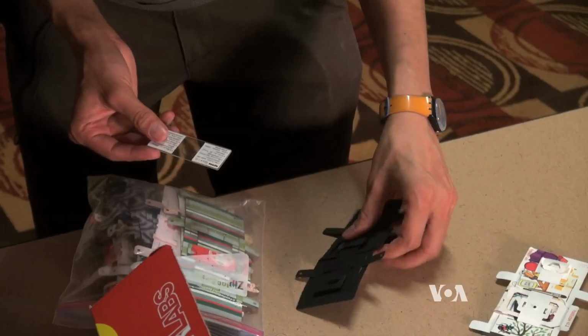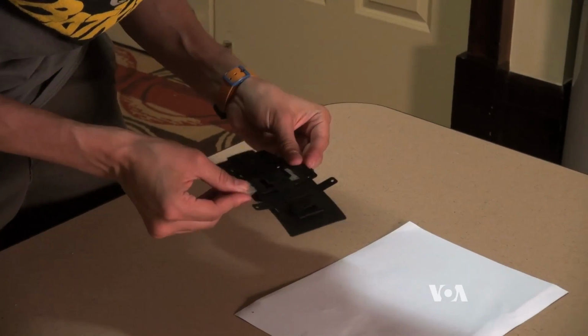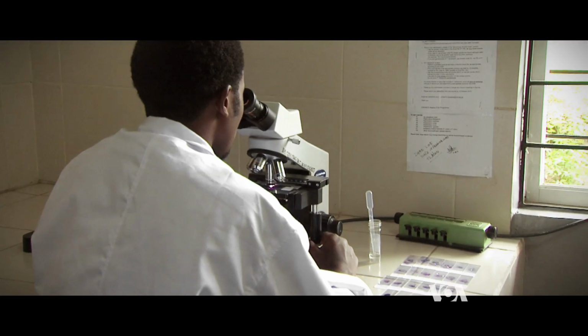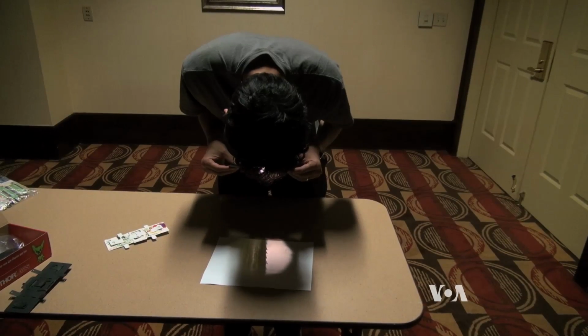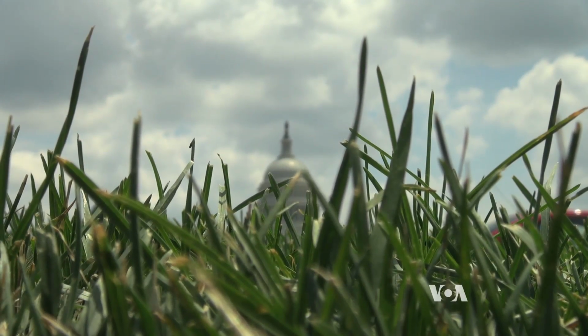As an engineer myself, I recognize that. But the microscope itself is not sufficient to change things. Health workers need training to know what they're looking for, she says. Without it, the microscope does not help much. But for the curious, Prakash says that the Foldscope will open a whole new world. Everything that's around us at a microscopic view is absolutely beautiful. Steve Baragona, VOA News, Washington.